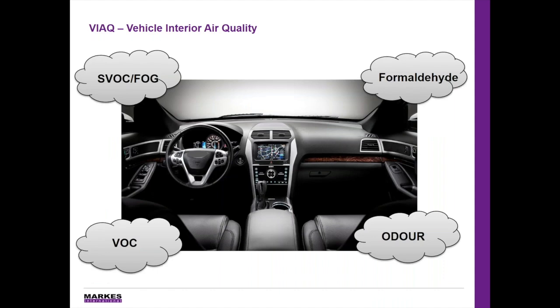Well, to improve and regulate the vehicle interior air quality, we need to know what chemicals are in the car cabin air. The air inside the car can be quite a complex mixture because you've got all the different sources for the emission of a wide range of compounds. The typical car trim materials include plastics, foam, wood, leather, carpets, and adhesives, also a big one for VOCs. These different components and materials can release volatile and semi-volatile organic compounds that may have negative impact on human health, such as the aromatics and also formaldehyde, acetaldehyde, as well as the compounds specific to odors, such as reduced sulfurs, thermal labile, and reactive species. So the health effect is really the main driver for the regulations of vehicle interior air quality.